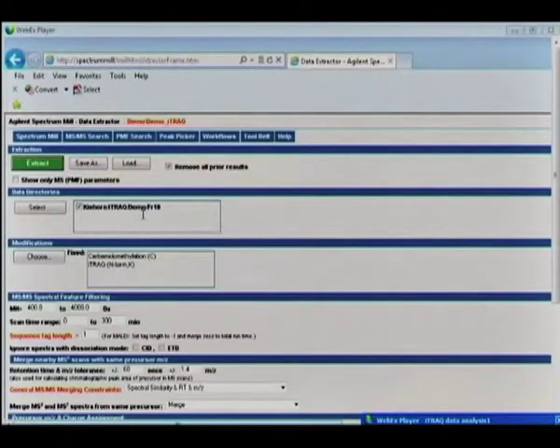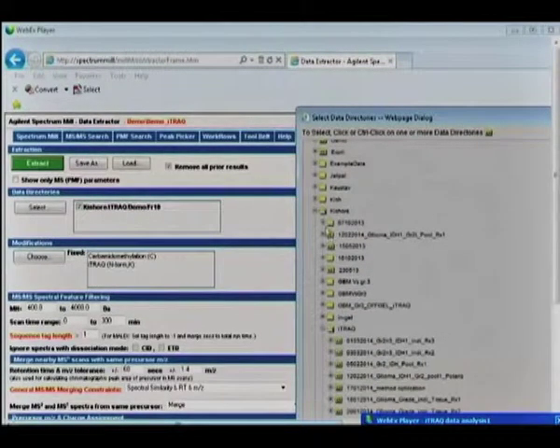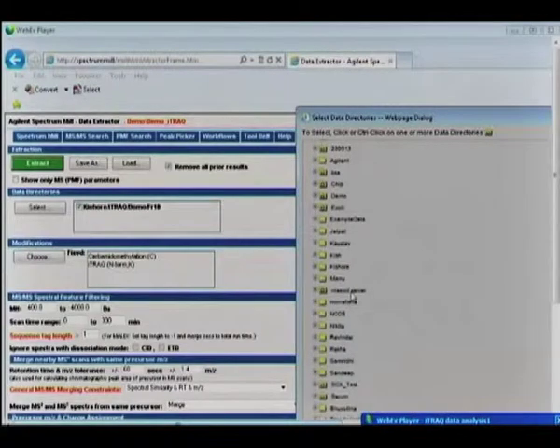LC-MS/MS data analysis can be started using the data extractor tool, where we can load our data files into SpectrumMill and prepare files for MS/MS analysis. Select the file from the folder named MSDataSM and upload the selected file into the software.